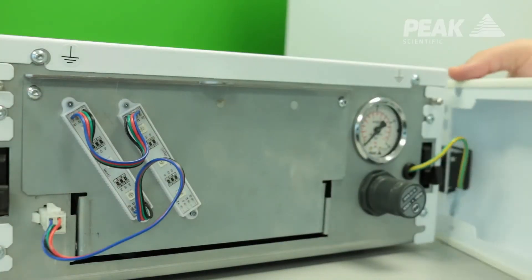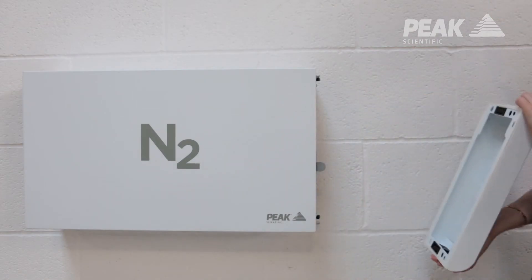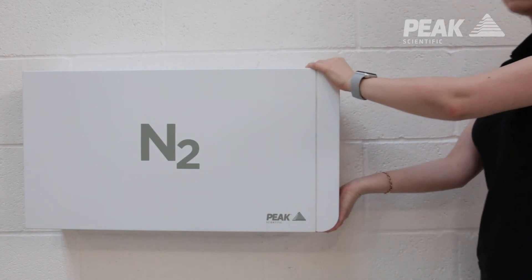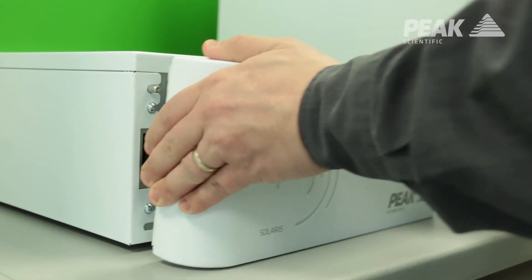We have made service access really simple for Solaris XE, so no matter where it's positioned within the lab, it's really easy to access the serviceable parts within the generator. It's a case of removing the front fascia and changing a couple of parts out.